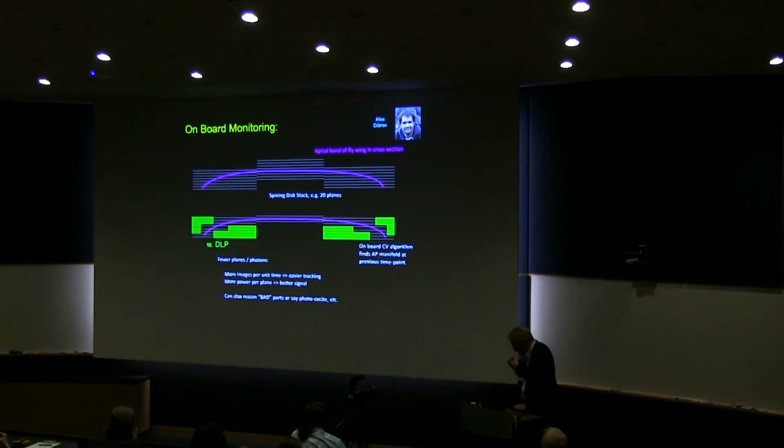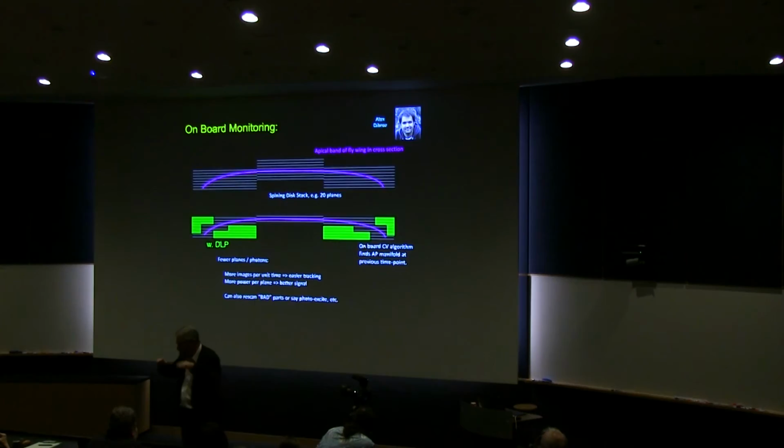And you know that how many photons you see is a function of how much energy you put in, right? And right now, not to kill the thing, to do those 40 planes, there's a limit on how much we put in. But now if I'm only collecting 3 planes, crank it up. Let's get as much photonic return from those ECAD molecules as I can. That's one thing I can do.